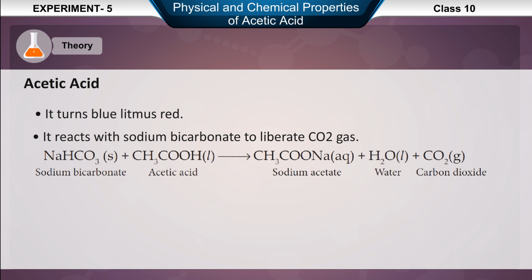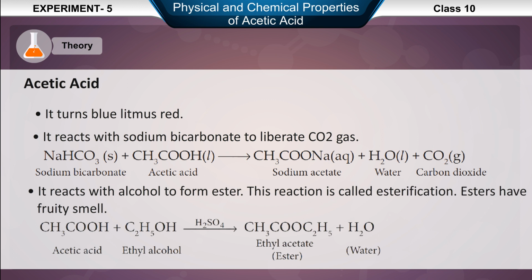It reacts with alcohol to form ester. This reaction is called esterification. Esters have a fruity smell. CH3COOH, acetic acid, plus C2H5OH, ethyl alcohol, with H2SO4 results in CH3COOC2H5, ethyl acetate, ester, plus H2O, water.